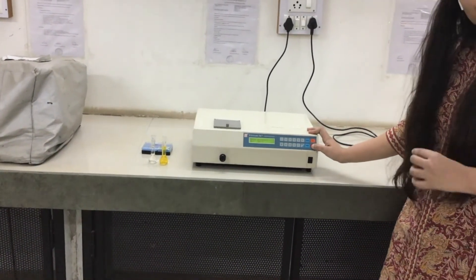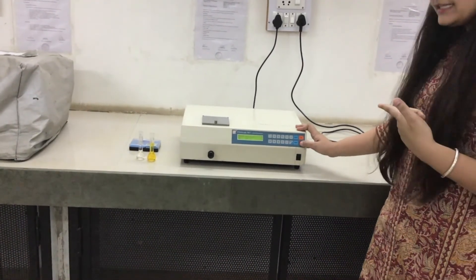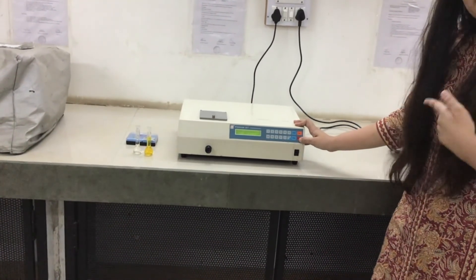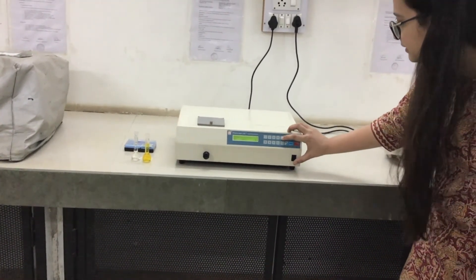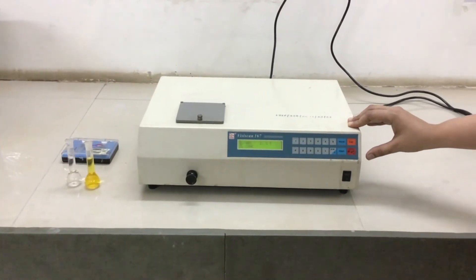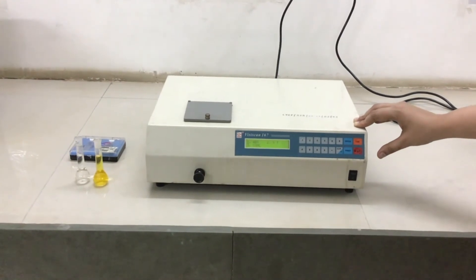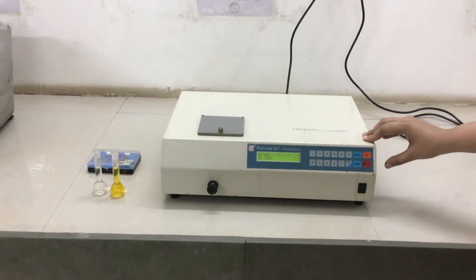We are analyzing a potassium dichromate solution, so we enter the wavelength 510 nanometers and press Enter. The display then shows three modes: absorbance mode, percentage transmittance mode, and concentration mode. Today we will use absorbance mode by pressing 1.